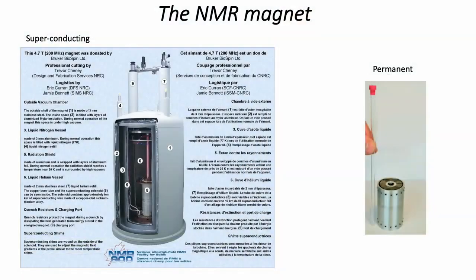So you've got to have a strong magnetic field to immerse your sample in. And obviously that's supplied by a strong magnet. So magnets will come in two flavors. In the benchtop instruments, they are a permanent magnet. Has anybody ever taken apart old computers and you can get the hard drives and there are strong magnets in there that are sort of silver colored? Those are made from a neodymium iron boron alloy. And that is what they use for the permanent magnets that are in the benchtop systems.